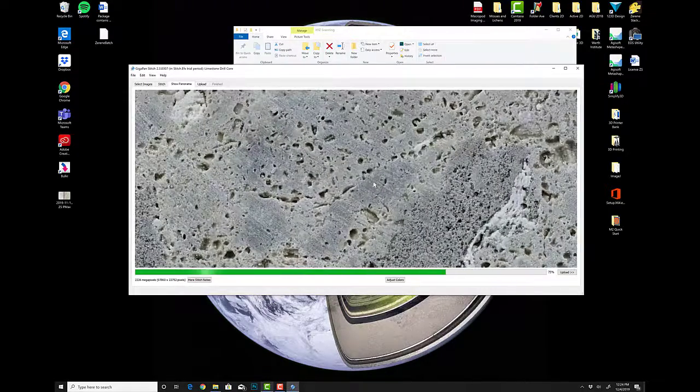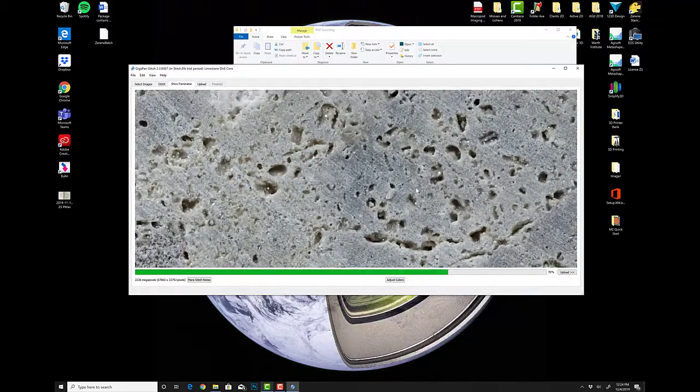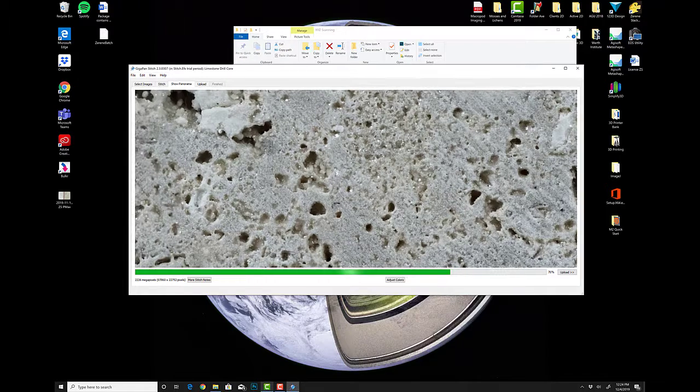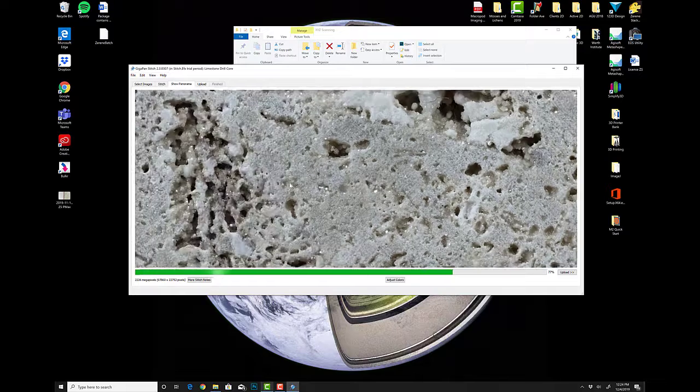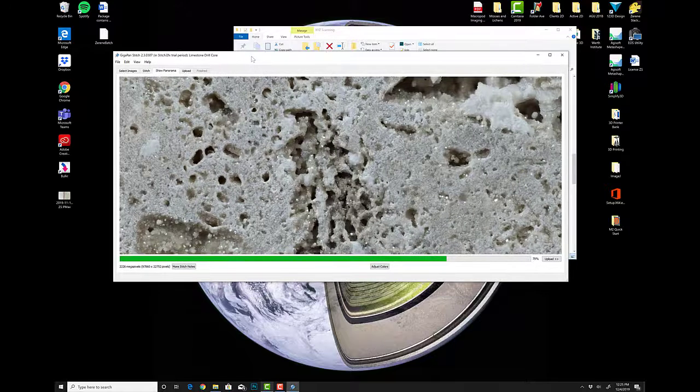So now this is a final high quality image captured at 1x optics with a 26 megapixel sensor. So this is going to be about 10 times the quality of what we were able to achieve before. And all in all, it's not very difficult. The whole process is automated. The entire scanning process is going to take about an hour. And then again, as you can see here, once you merge together the images in ZereneStacker and then merge them here, it's about another hour.